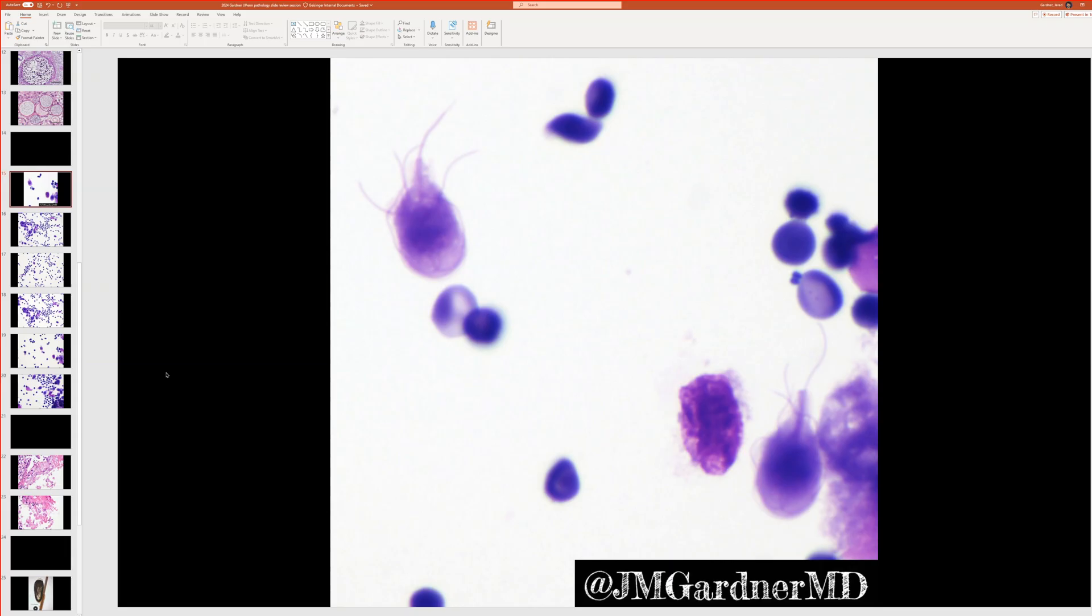So this is something you've probably seen before and heard of, but maybe a view that you don't typically get to see. But what is this little cutie, or there's two little cuties here?